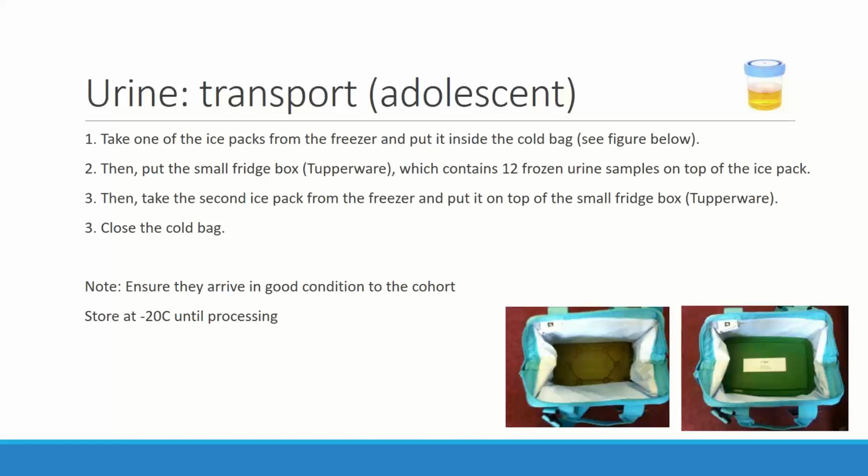And the samples will be transported to the visit. Once the samples arrive to the visit, please check they are still frozen. If this is not the case, maybe we have to think how to do this in a different way. But at least we have not had any problem with the system here in Sabadell. So yeah, let's do it like this. If there's any problem, let us know. Okay.